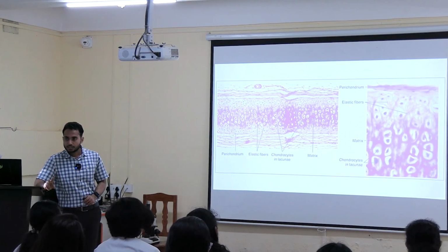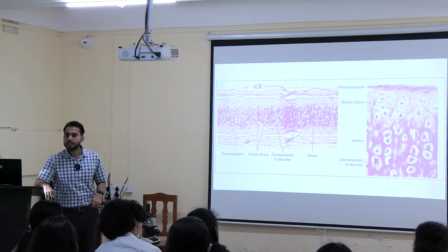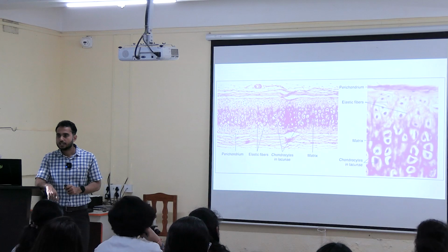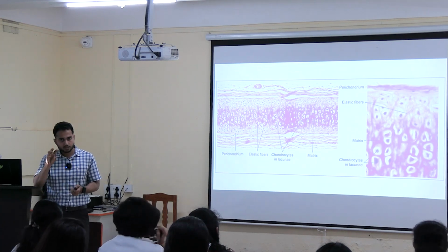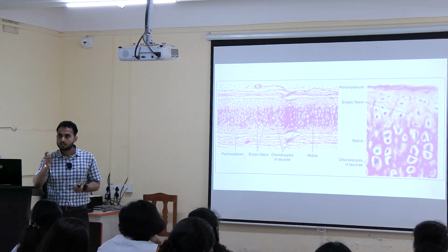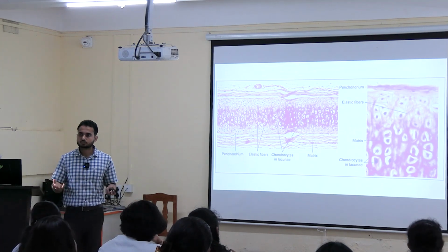Next point, can you see the lacuna? These large spaces are nothing but the lacuna. In elastic cartilage, lacuna are present, but the size of the lacuna is larger.